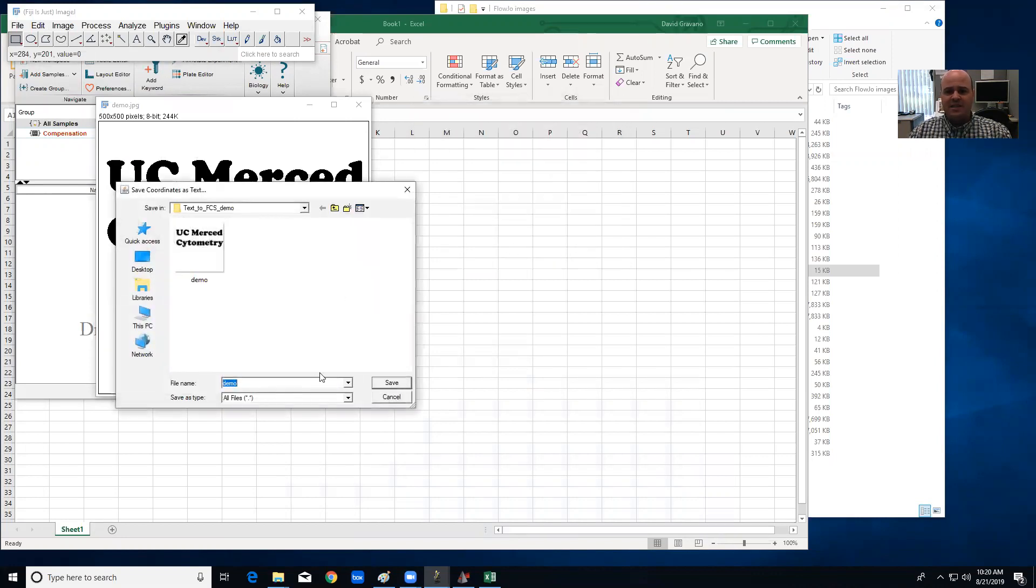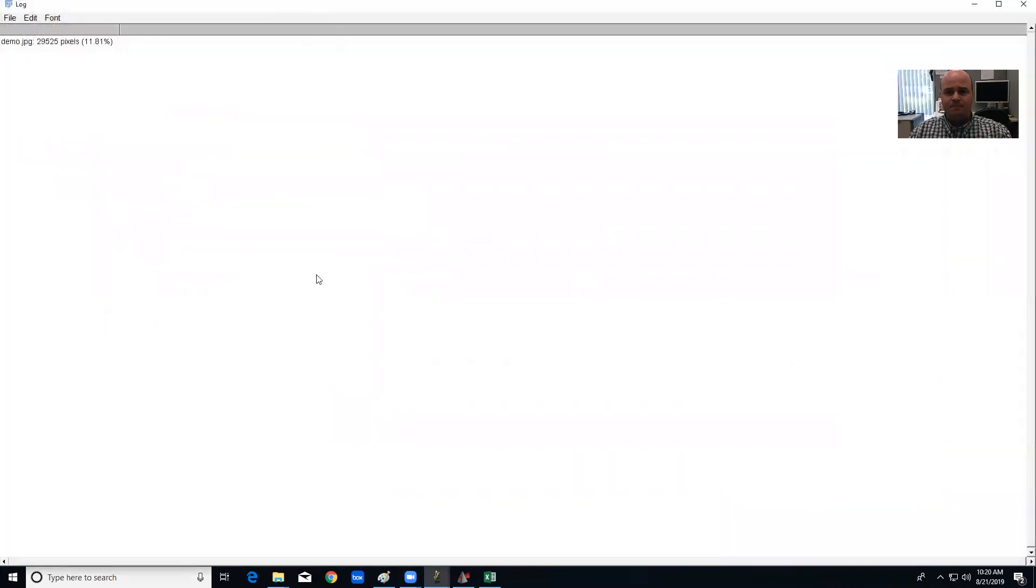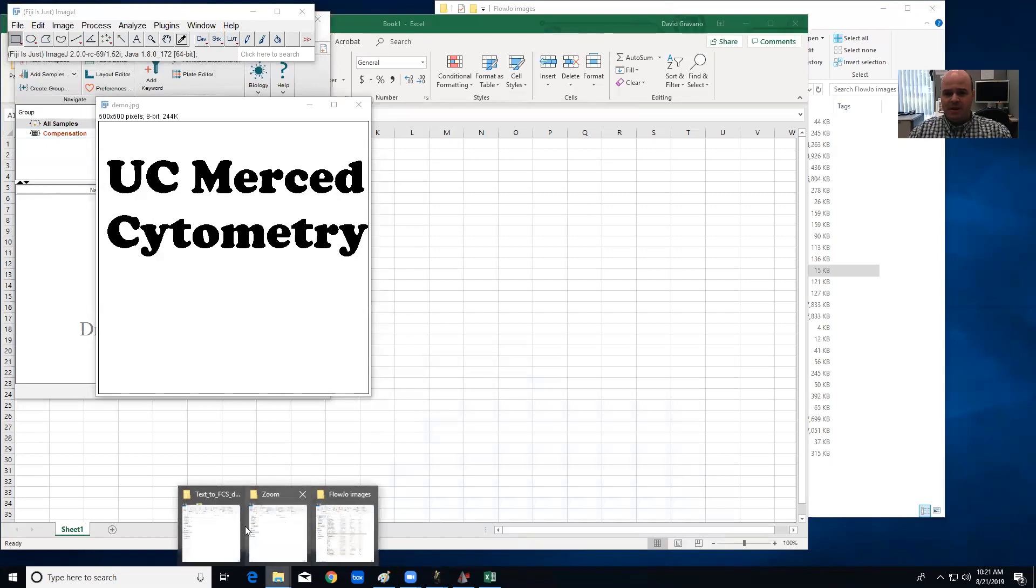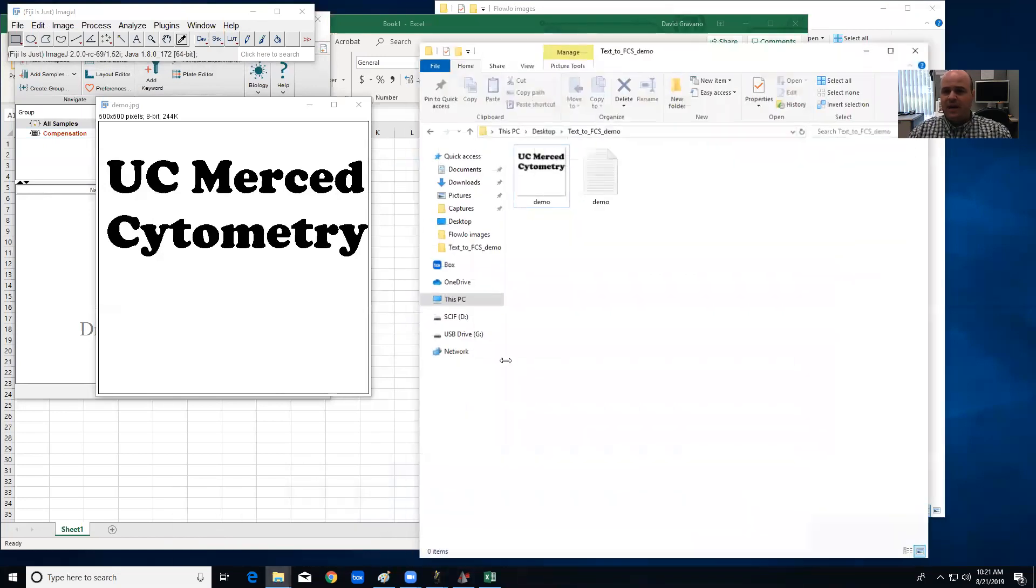And it's going to ask me where I want to save this. I'm going to save it here and it told me that it exported 29,000 pixels roughly, and that's fine.